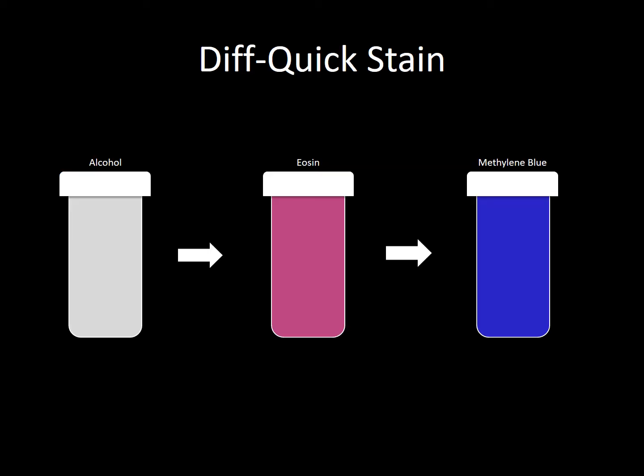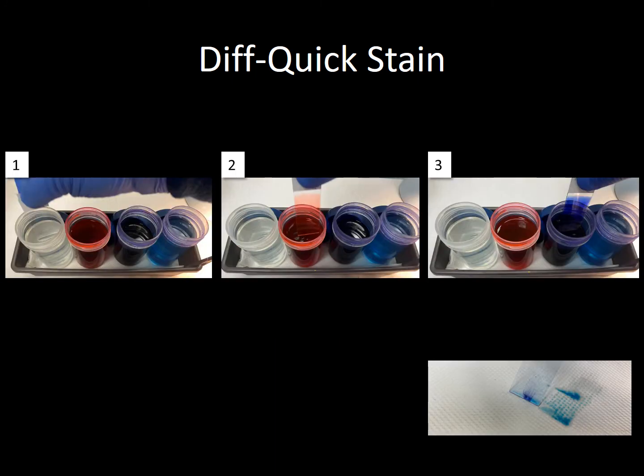The Diff-Quik staining method is one of the most commonly used worldwide. It is a quick method with a very short staining time and uses three different solutions: alcohol, eosin, and methylene blue. The slide must be fully air dried before going briefly into the first solution, which is methanol. The slide is then removed, held vertically, and gently tapped on a dry paper towel to remove the extra liquid, then moved into eosin for a few seconds. The excess liquid is again removed, and the slide is dipped into methylene blue for an additional few seconds.